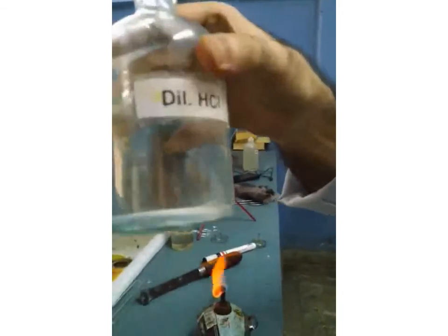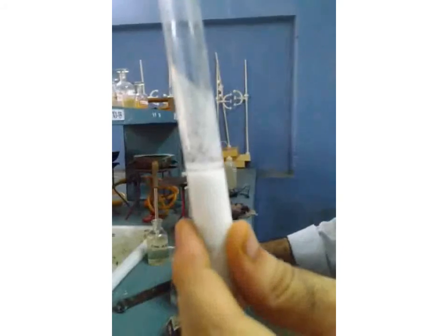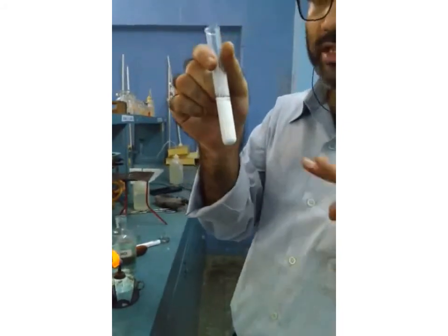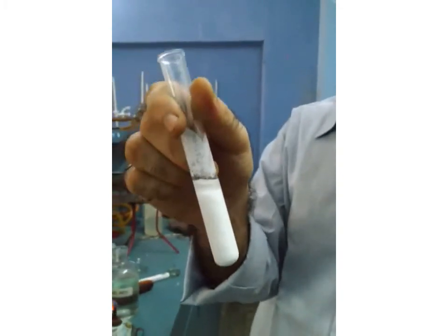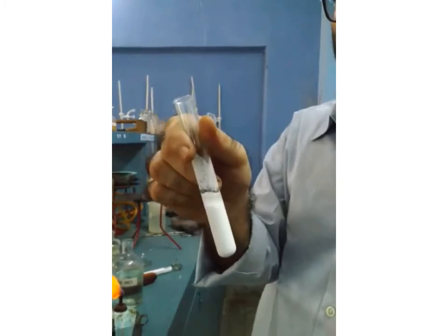The moment I added hydrochloric acid and poured it in the solution, what you got is lead chloride, a white precipitate. This is not a confirmatory test for lead, but it gives us the information that group 1 is present. So this confirms group 1 is present. This doesn't confirm lead is present.